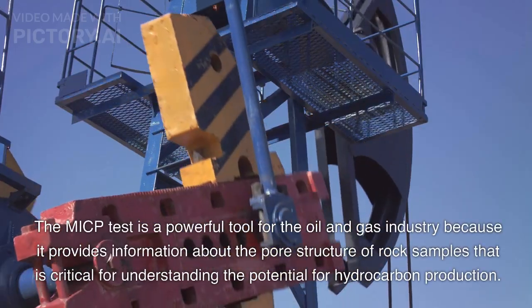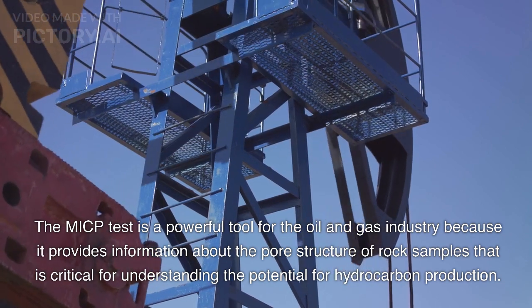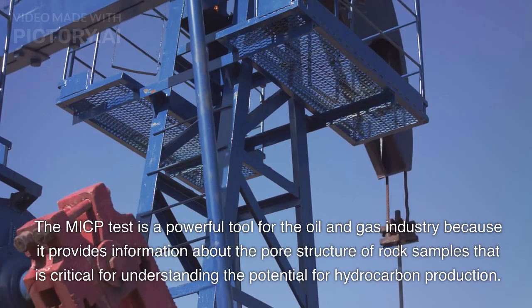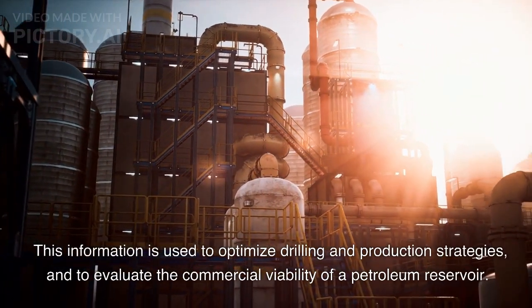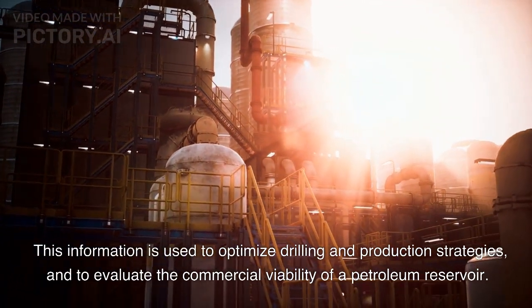The MICP test is a powerful tool for the oil and gas industry because it provides information about the pore structure of rock samples that is critical for understanding the potential for hydrocarbon production. This information is used to optimize drilling and production strategies, and to evaluate the commercial viability of a petroleum reservoir.